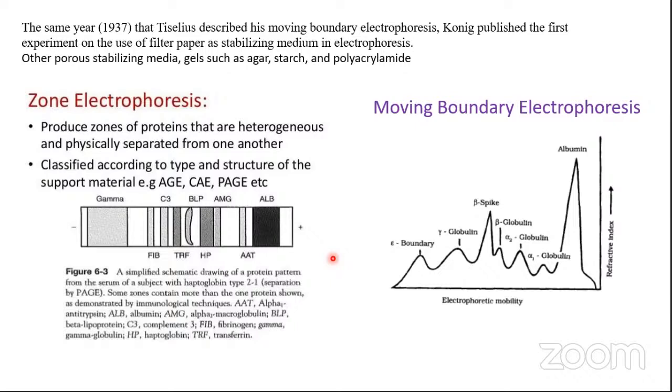Can anybody tell whether it is a problem during electrophoresis or a problem after the electrophoretic procedure is over?